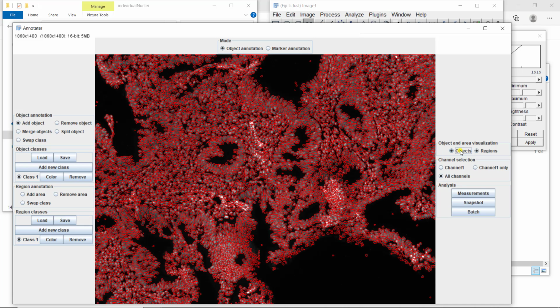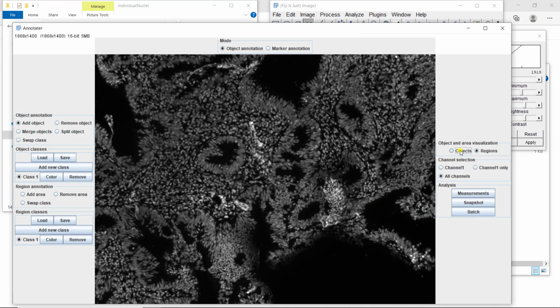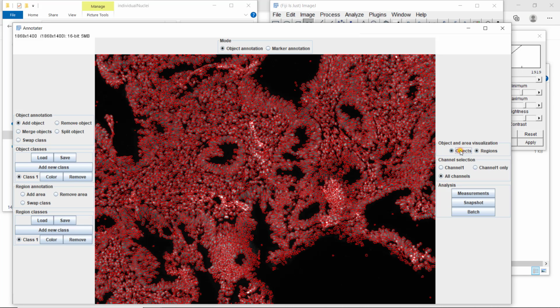What you can see, and it makes a lot of sense given the way we implemented it, is that wherever we have signal, we have nuclei. That makes sense because we obtain an object component based on the background. So everything that is not background is part of a nucleus. So we have nuclei everywhere we should have them. Now, the separation between them looks pretty okay in the stroma and even in the epithelium, not too bad. But it's probably not as accurate as the one we obtained with Mask R-CNN.